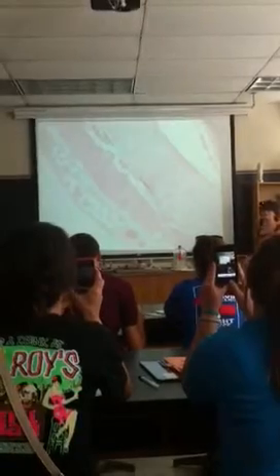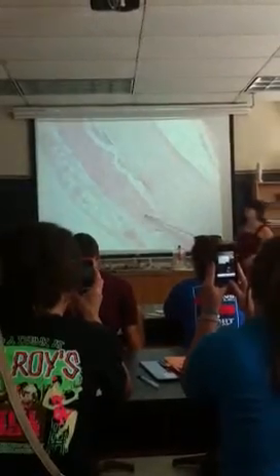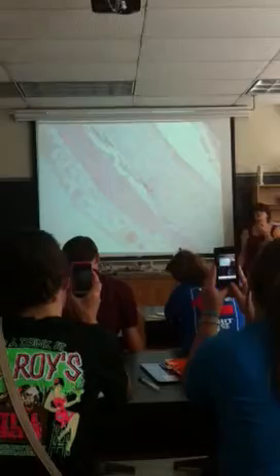And then we go a little further out, and then we get this layer right here. And what kind of tissue does that look like? Just based on the color alone, it looks like what? Muscle, right? This is smooth muscle. Specifically, the trachealis muscle, which lines the trachea.